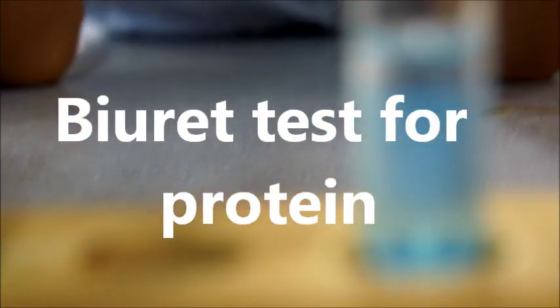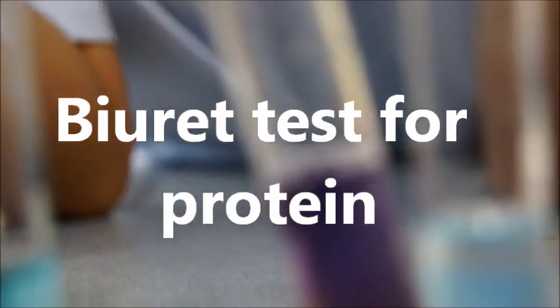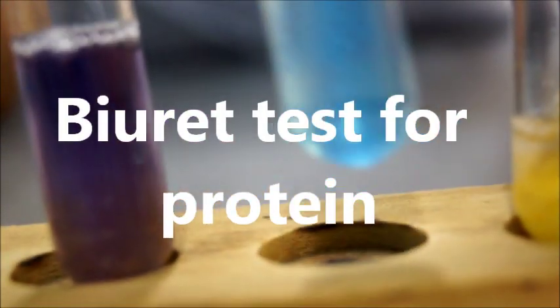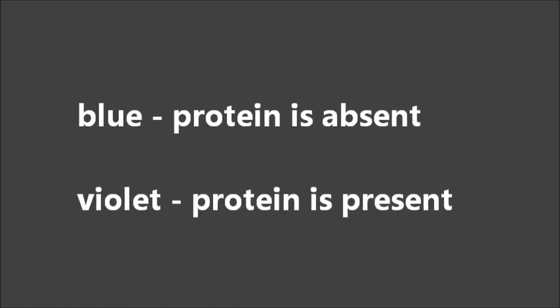Biuret test for protein: Blue — protein is absent. Violet — protein is present.